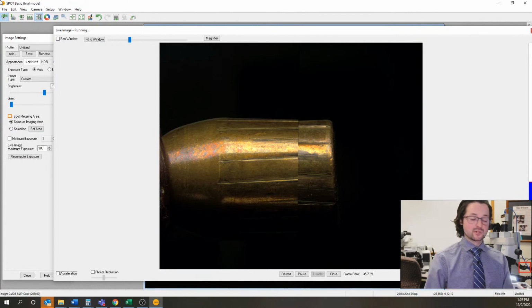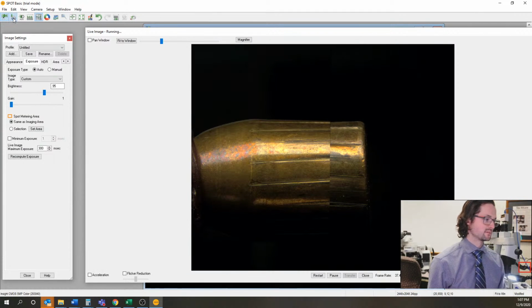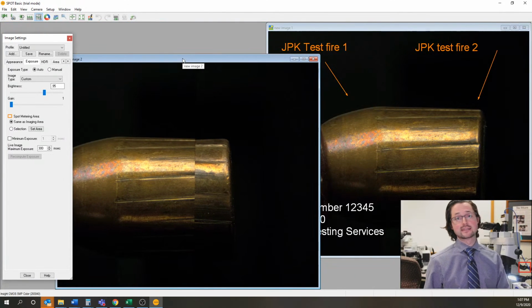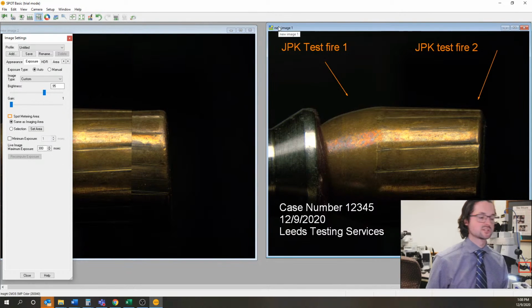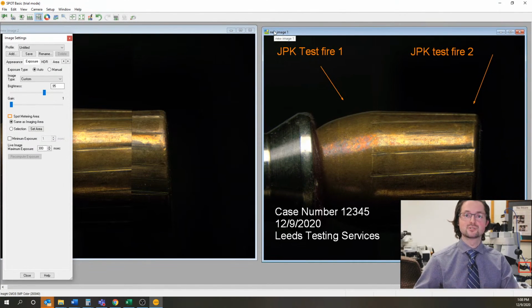So we're going to take another picture. We're going to come in. We're going to hit the capture button. And so this is our new picture. And what I could do is just like what I did last time, where I go in and I have to draw all these text boxes. Alternatively, what I can do is select this picture that I just captured, that I did all these annotations on, that I really liked. I can just select this picture and use this picture as my template.